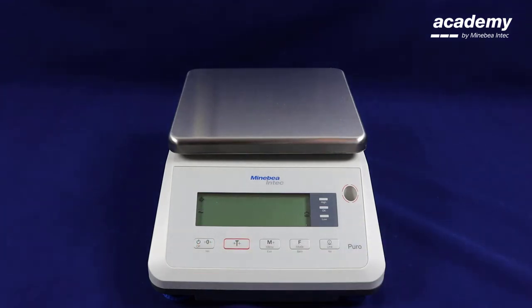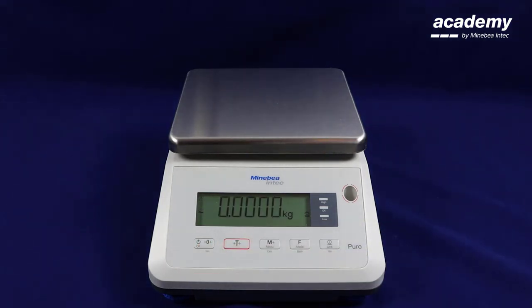You can use the zero key to return the scale to zero. Thank you for your attention.